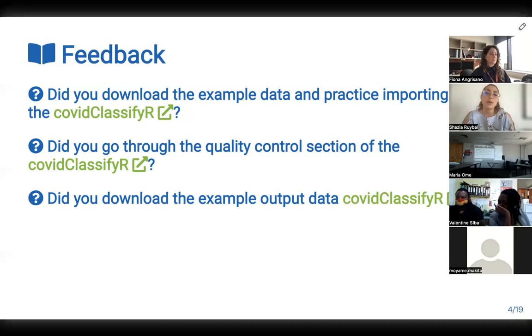Maybe that's a no. So we can go through that now, but essentially, if you did practice importing the raw data files, went through the application sections, and downloaded the data, then there's also an example of what that downloaded data should look like, for you to cross-check and make sure that yours also looks the same.